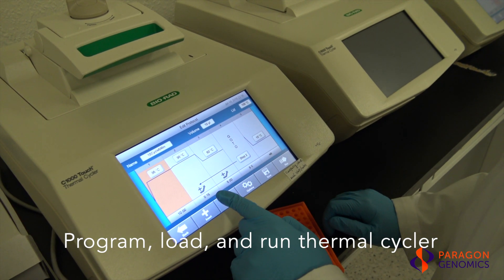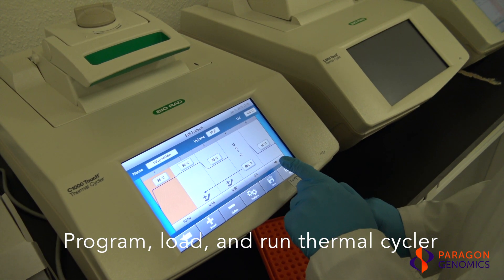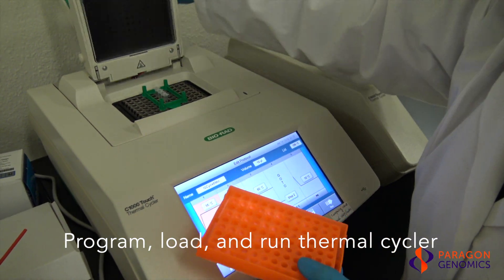First, program the thermal cycler according to the thermal cycling conditions for the multiplex PCR reaction provided in the user guide. Load samples and run the program to amplify target DNA regions.